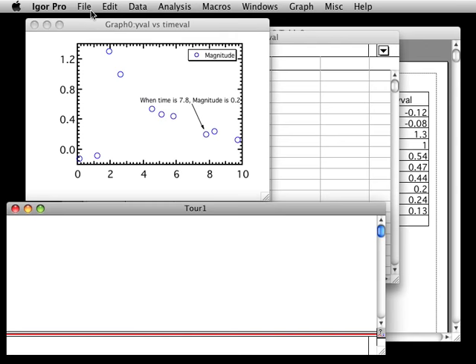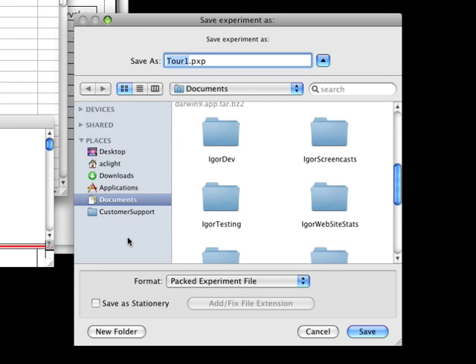When the Save Experiment As dialog appears, make sure that Packed Experiment File is selected as the file format. Type tour1a.pxp in the name box.